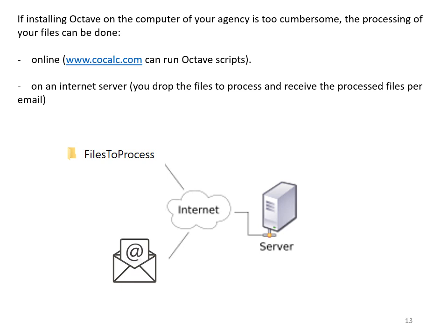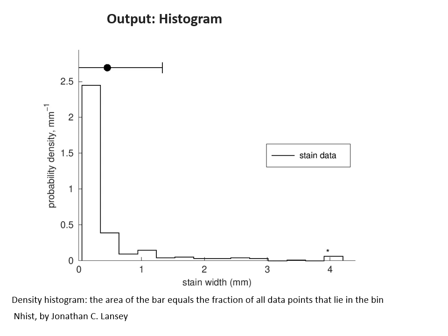What is the output? The output is a series of pictures where you have your results. So the first results that I was interested to plot is a histogram. On the horizontal axis, you have the size of the stains, and here precisely we measure the width of the stain, because it doesn't depend on the impact angle, just on the impact velocity and the size of the drop.